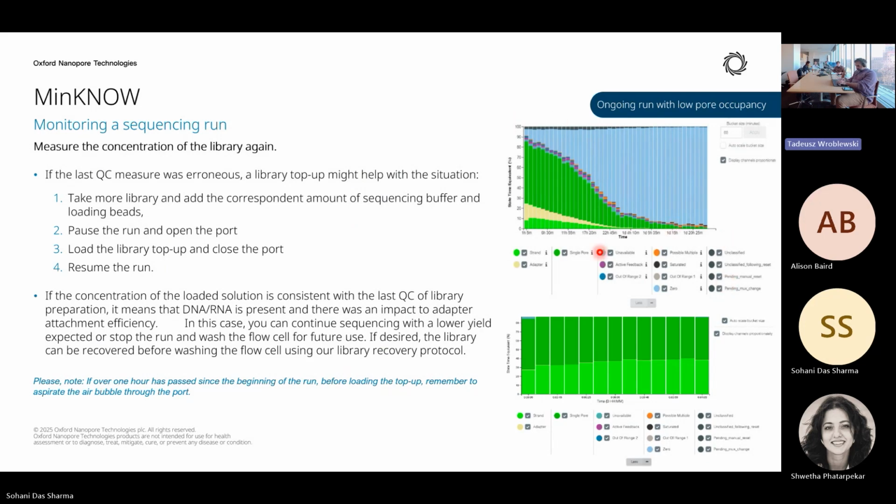For this one, see, it happened after like 1 day, 20 hours. The blue part, which is the inactive or zero pores, available, appeared after close to 2 days. So I think that's not bad, at least for cfDNA, that's what it looks like.